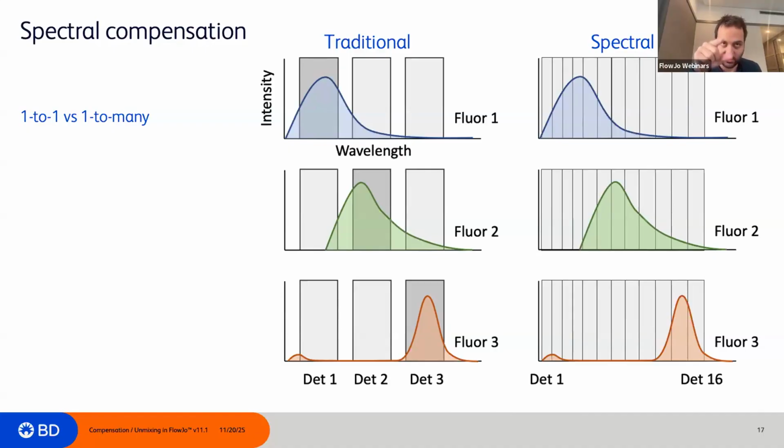If you have beads, it will really use the portion of cells with similar scatters. So if we have many differences in the scatter intensities, those will not be inside this gate. So I suppose this process leads to fewer doublets, because it's not going to use the different scattering intensities that doublets would typically have. So it would isolate more, or gate more, singlets in that case.